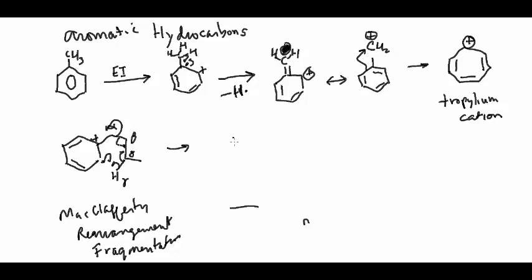And here we go. The fragmentation produces a smaller radical cation and an alkene, a neutral even number alkene byproduct. The alkene byproduct's right here. You see forming a pi bond there, so boom, boom. This part right in here produces that. And we draw the radical cation structure.